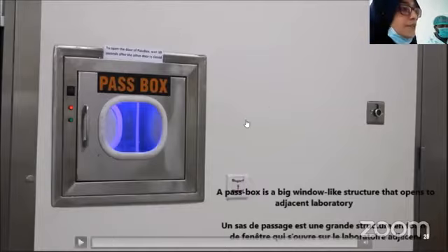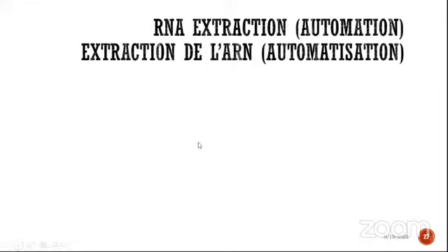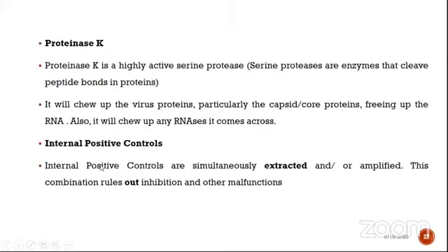Thank you. So I'm moving towards the RNA extraction by automation. After manual RNA extraction, we are now going to discuss the RNA extraction through the automation.